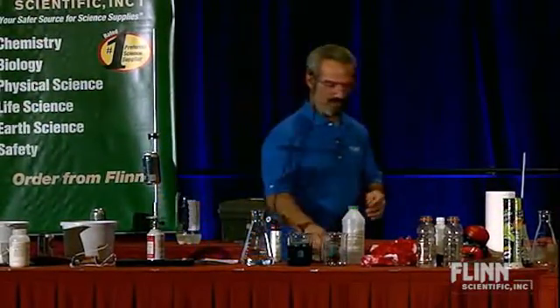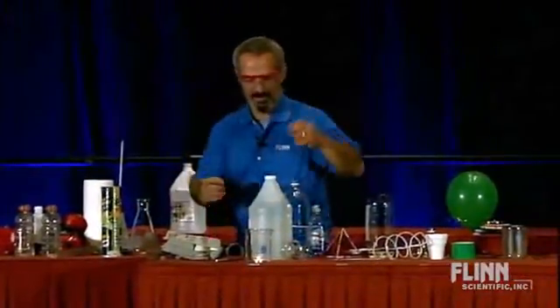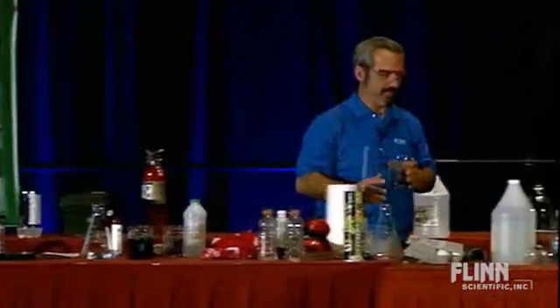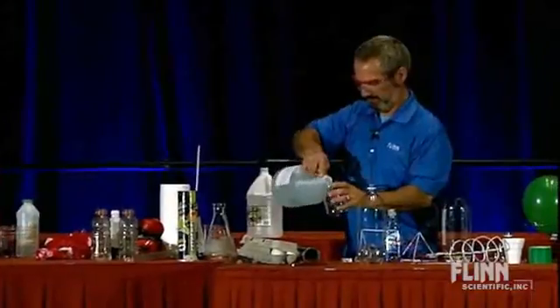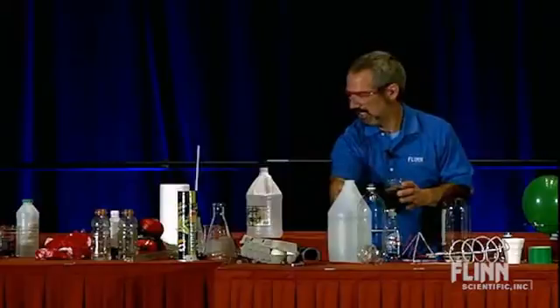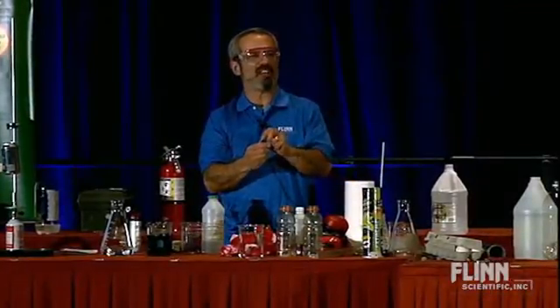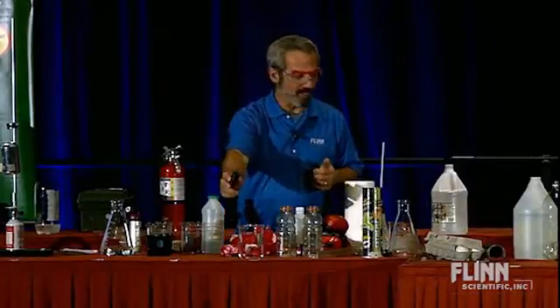One of my favorite demos of all time. This is just water. And I have a compound here called calcium carbide — got about two or three grams of it here. If you haven't seen calcium carbide, you'd swear it looks like little gray pebbles, not very impressive, until you put it in water.